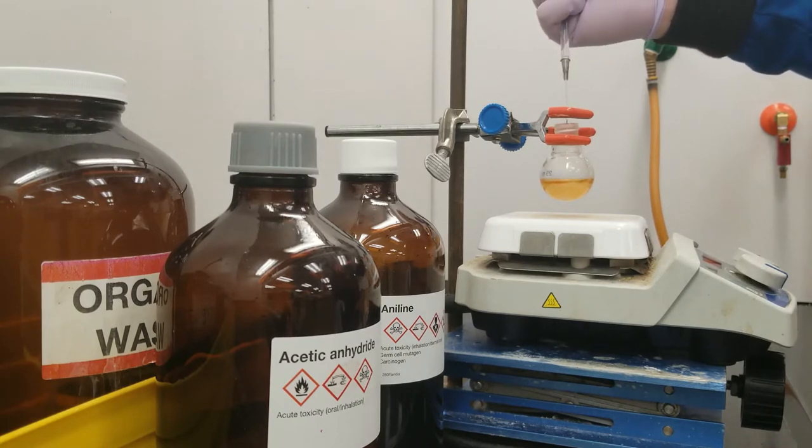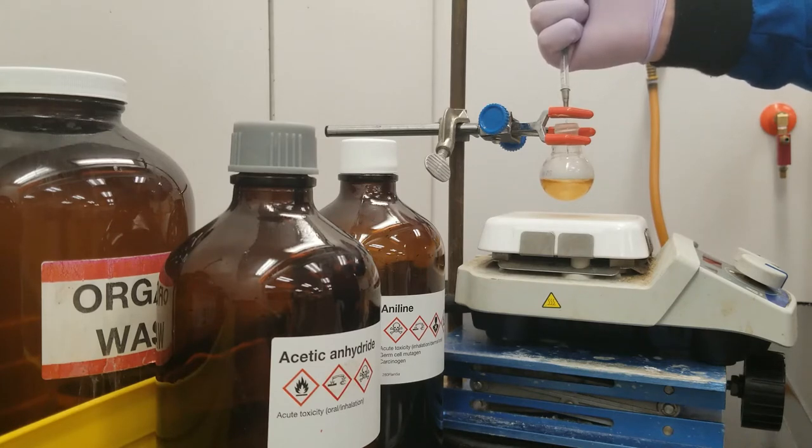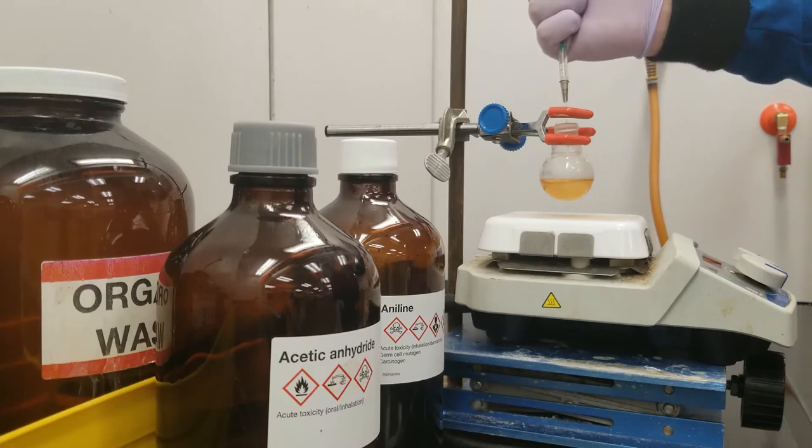I'm going to stabilize the plunger of this syringe with my fingers and give my thumb a lot of resistance so that I really need to push and get a nice slow addition of acetic anhydride. As I do this over the next minute or so, you may see a change in the color and appearance of the system. Sometimes when we do this reaction, the acetylated aniline crystallizes rather quickly; other times it happens over the five-minute reaction period after all is added.